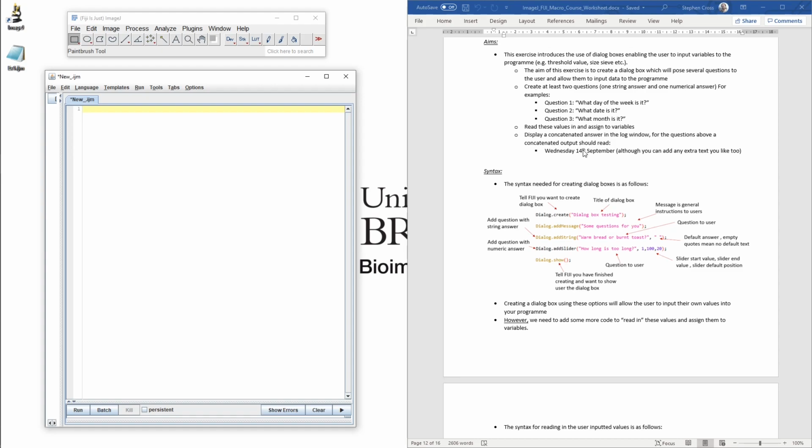One thing to note here is the "th" there. Obviously, depending on the day of the month or the date, that will change.